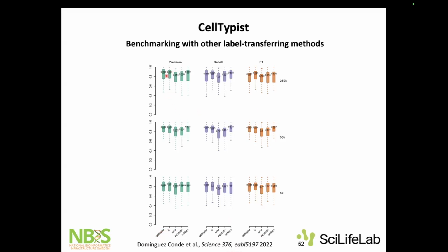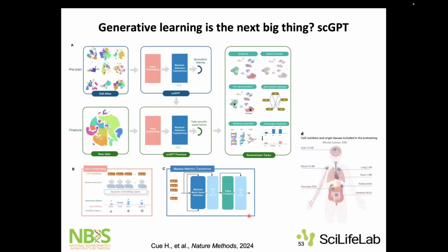They have very high precision, and their F1 score is also high. Of course, they are just comparing it with what is similar. It would be really interesting to see those compared with other methods as well, not only those that are using a similar machine learning method.